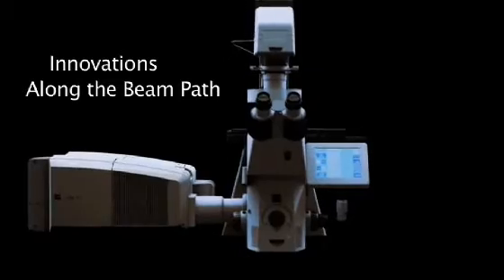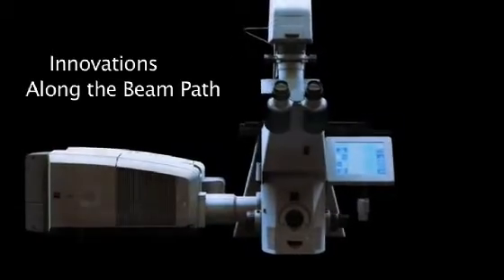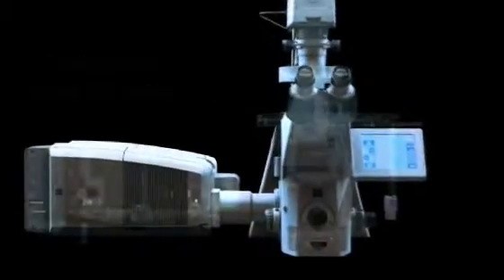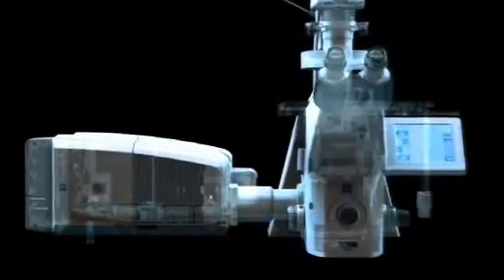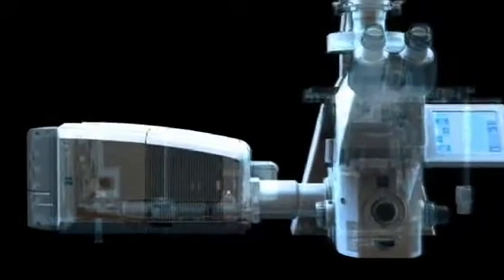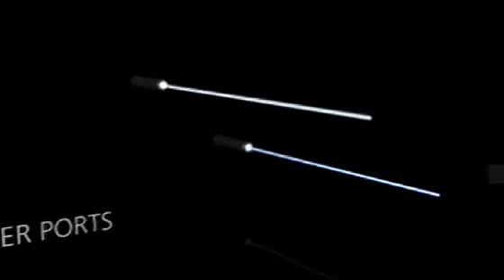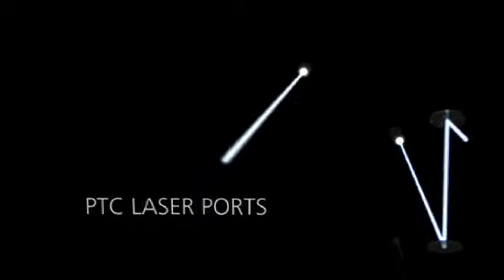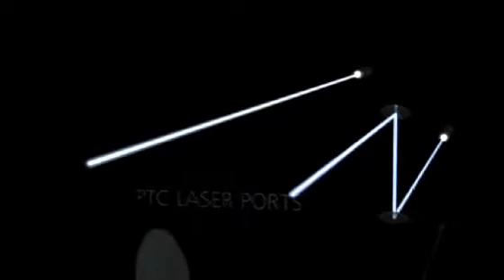The outstanding performance of this system is due to four crucial innovations in the scanning head. The new PTC laser concept replaces the laser module with single so-called pigtailed lasers. Up to eight different lasers from the near UV, the visible, or the infrared range can be combined and coupled directly into the scanning head.